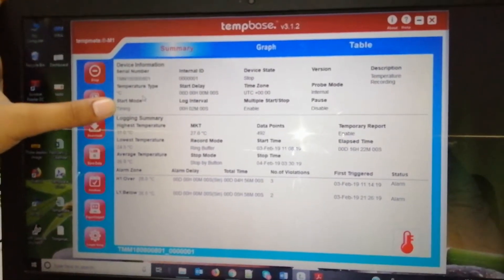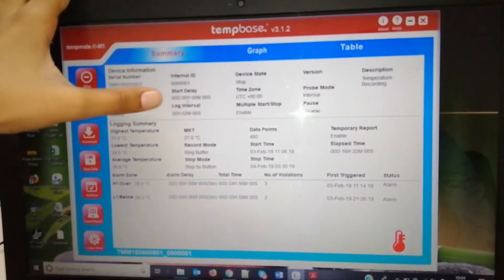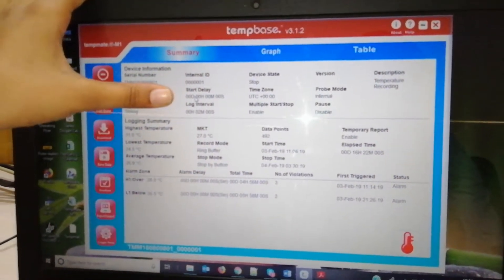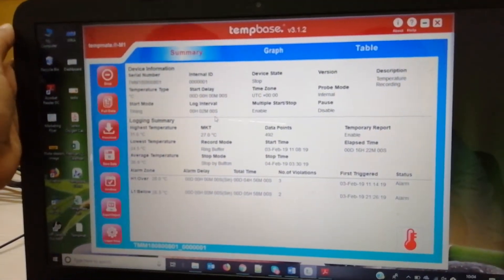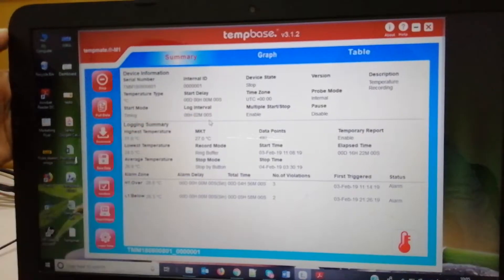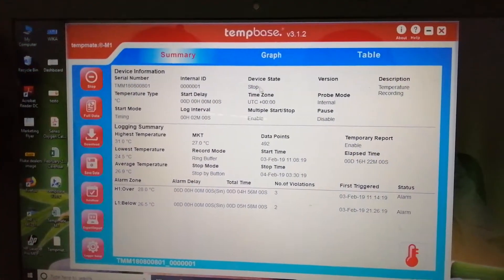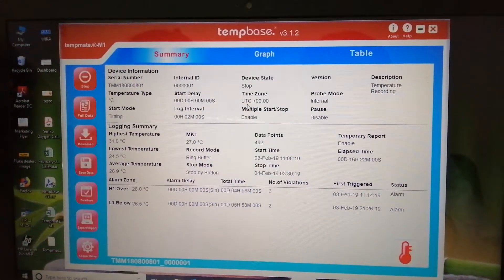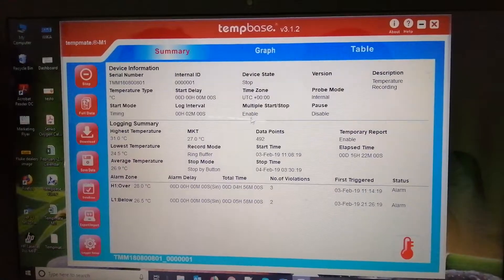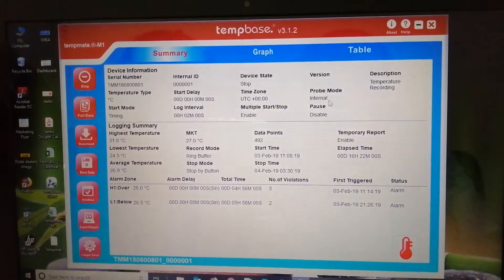Here you can see the summary with device information, temperature type — whether it is in degrees Celsius or Fahrenheit — and the start mode. This is the start delay, which you can set based on your application. This is the log interval, which I previously set as two minutes. Since the device is currently under stop mode, it shows device state as stop. You can set the time zone and the probe mode is internal, as the sensor is an internal sensor.